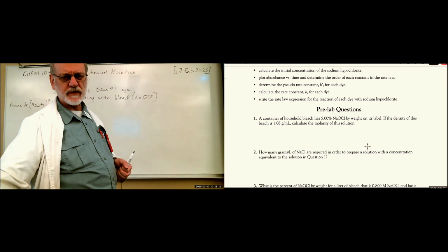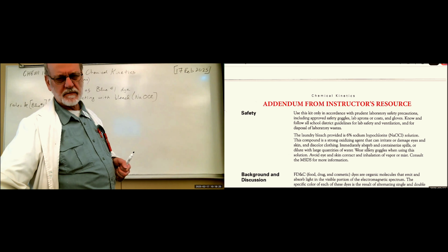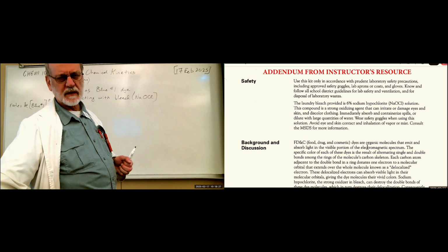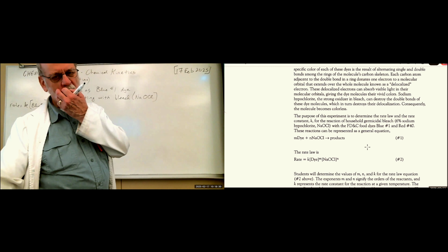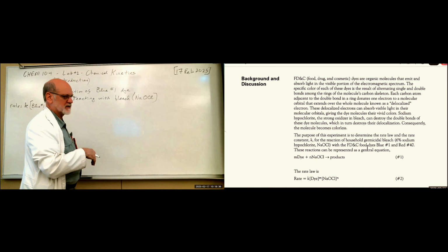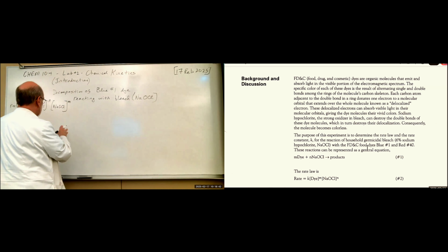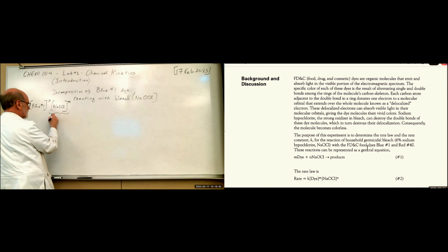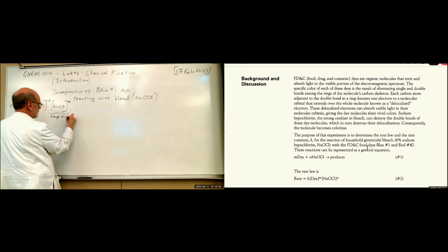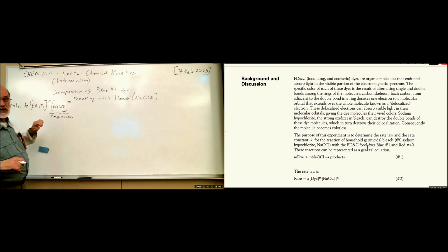Let's see, before we do the pre-lab questions, there's your safety blurbs. I will say this. How are we going to track the concentrations? Well, the bleach, the sodium hypochlorite, is going to be the one that we have in large excess. Like I mentioned earlier, large excess, so this one doesn't change during a reaction. And we allow this one to change.